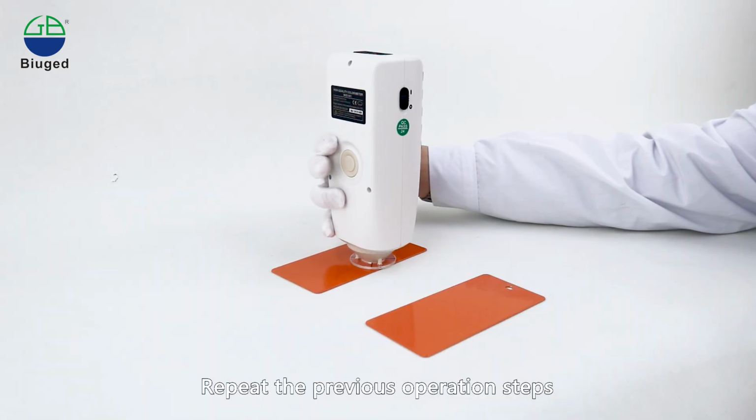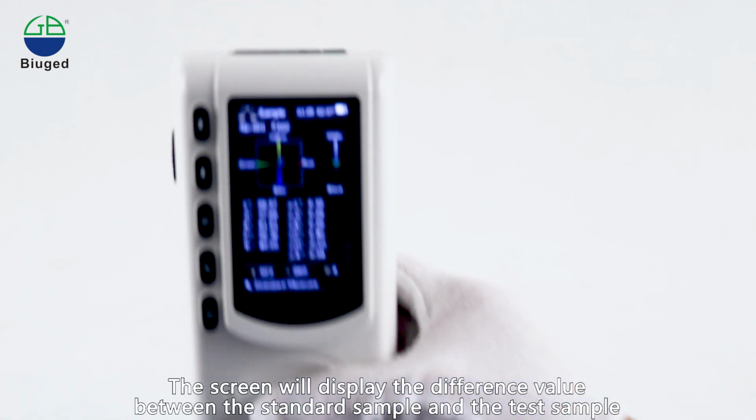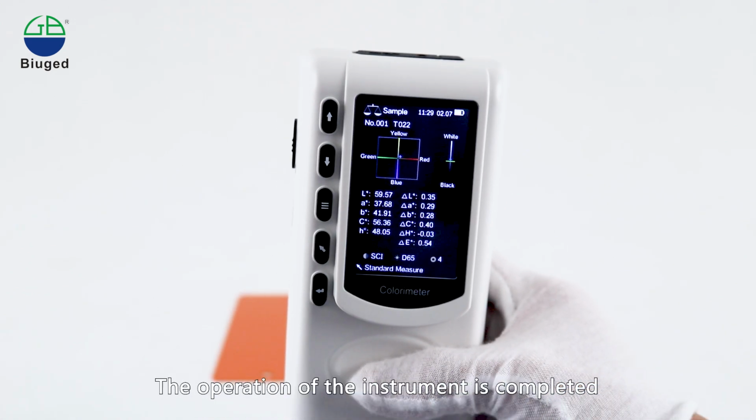Repeat the previous operation steps. The screen will display the difference value between the standard sample and the test sample. The operation of the instrument is completed.